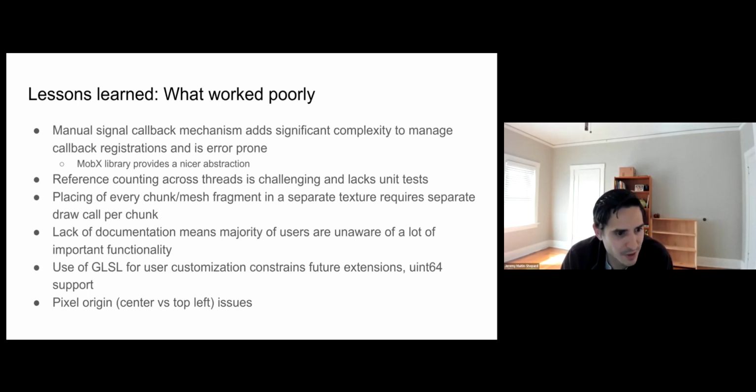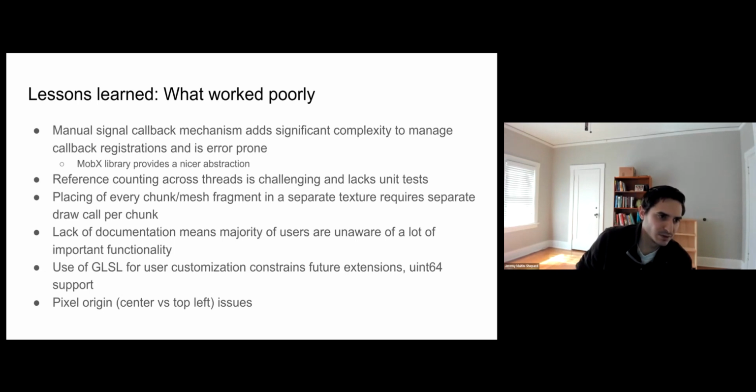I feel like with EM data, especially when we start dealing with segmentations, I did have the mindset of a pixel. In practice, we usually did view the data without interpolation, so a pixel is shown as a square, and especially with segmentations, there's no interpolation. So this idea of a pixel as a square or a cube, whatever, that was the mental model I was coming into this with. And in terms of how the downsampling is typically done, it also seemed to make sense to treat them as the top left corner.